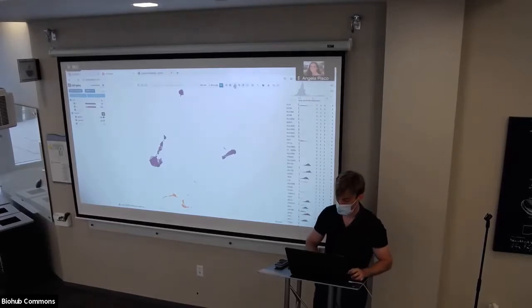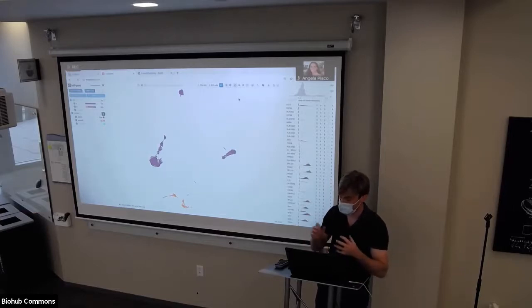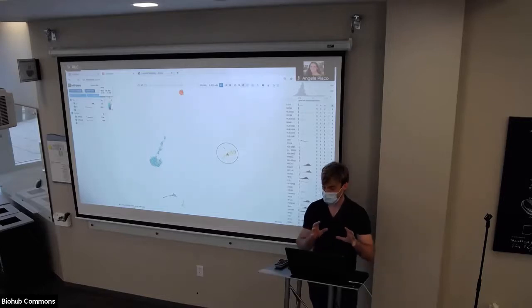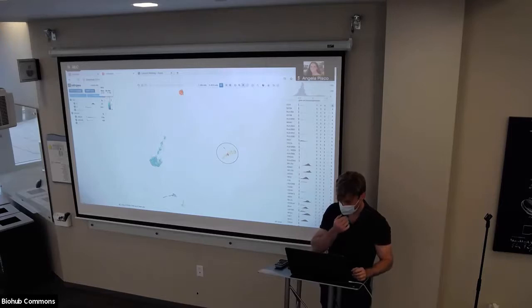The LiDAR tool also is useful for people who may have trouble seeing colors. For example, if you're coloring by gene expression, maybe they have a hard time distinguishing between different shades of this color bar. So you can use the LiDAR tool to display metadata about the gene expression within your radius of interest. So here you click and it says, okay, for CD74, within the targeted region, I have mean expression 2 with standard deviation 0.8. Eventually, this is going to turn into a histogram that shows up to be a little bit more informative than just some text. But for now, this is still a nice proof of concept.